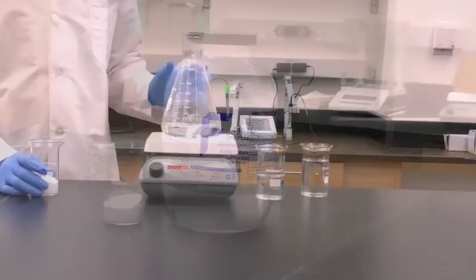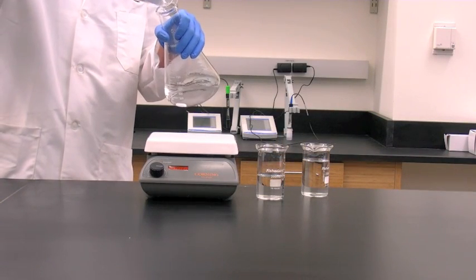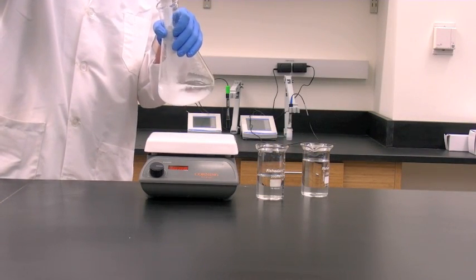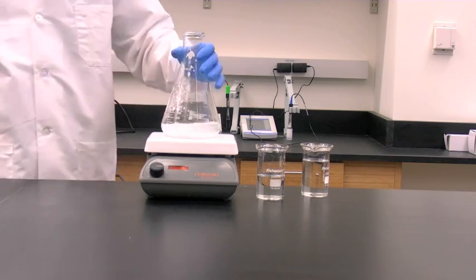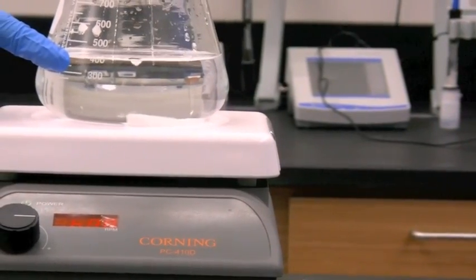Using another 1 liter flask, slowly add 50 grams glucose into 200 milliliters of distilled water while stirring. Heat the solution on the hot plate to dissolve completely.